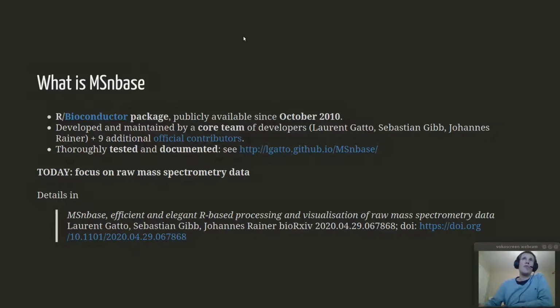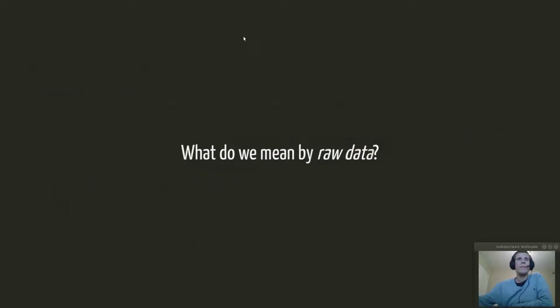MSnbase offers a wide range of functionality, but today I'll be focusing on the efficient handling of raw mass spectrometry data. More details about this specific feature can be found in the recent MSnbase preprint. But let me start by clarifying what we mean by raw data.